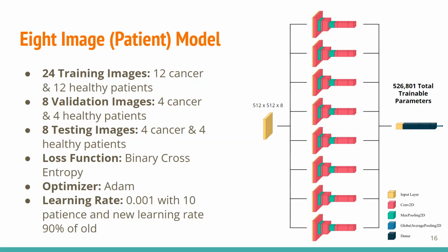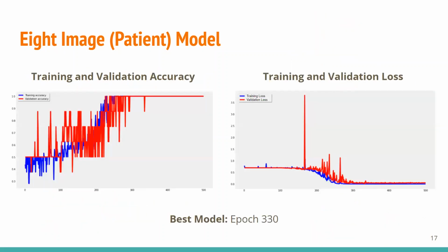We have even fewer inputs. We don't have 320, we only have the number of patients we have, which is 40 inputs in the data set. So we really can't have a high learning rate for a long time, otherwise it'll just overfit. And as you can see, we did run into overfitting as a big problem with this model. Our training validation accuracy hit 100% around epoch 300.